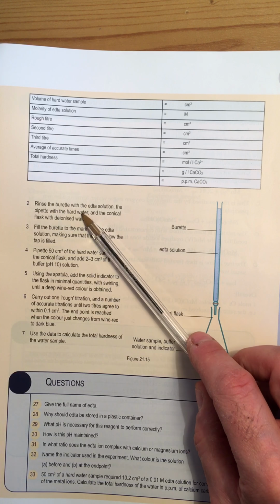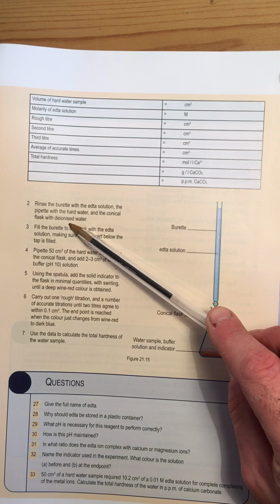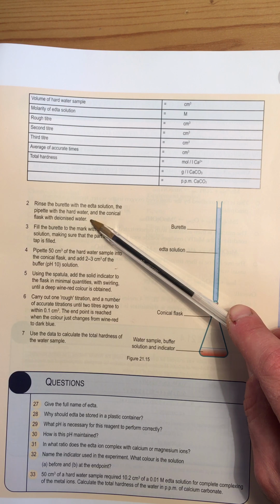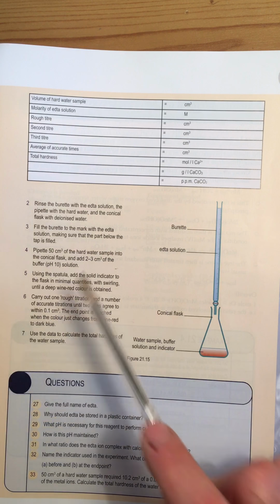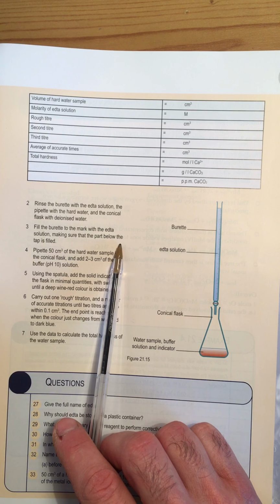I'll correct myself there. The pipette is rinsed with the hard water sample, and the conical flask is rinsed with deionized water. This is very important that deionized water is used here, because ordinary tap water would contain calcium and magnesium ions, so that would affect your result. Fill the burette to the mark with EDTA solution and make sure that the part below the tap is filled.